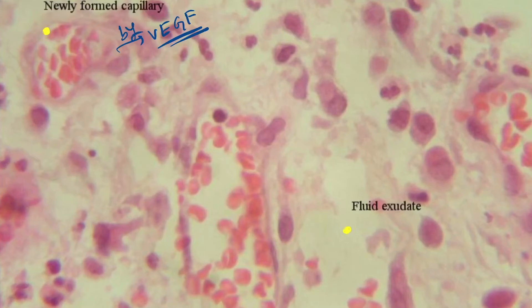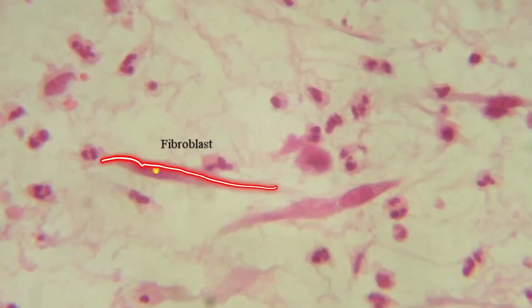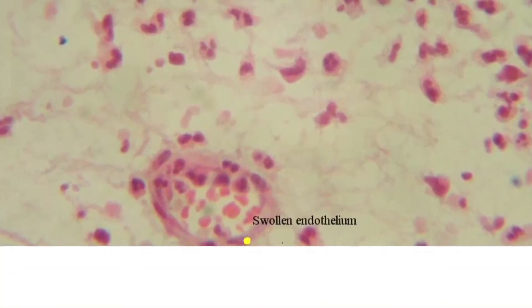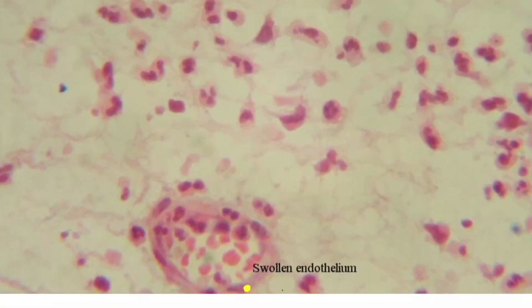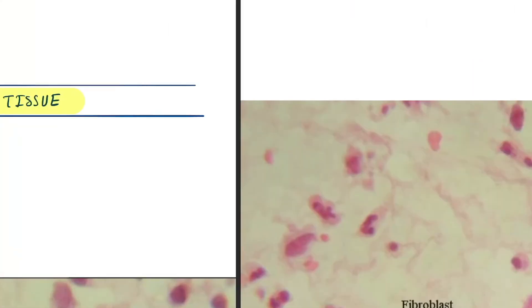Next, you can see the exudative fluid. In the next picture, you can see the fibroblasts, and here you can see the endothelium is swollen—that is a congested blood vessel.